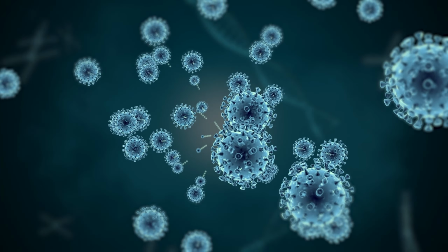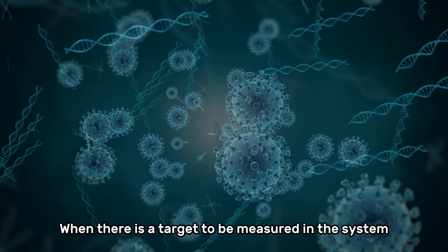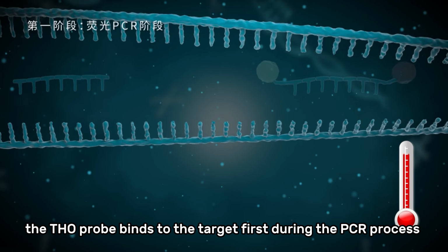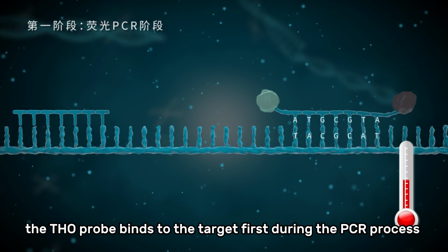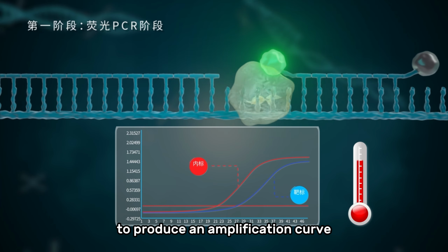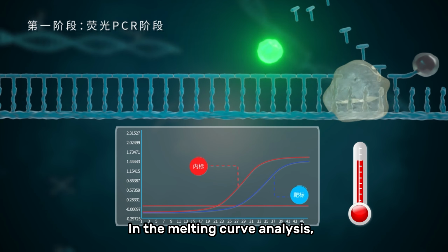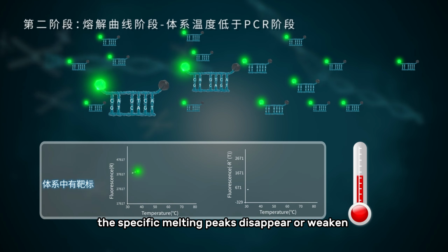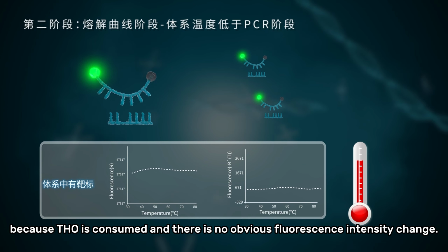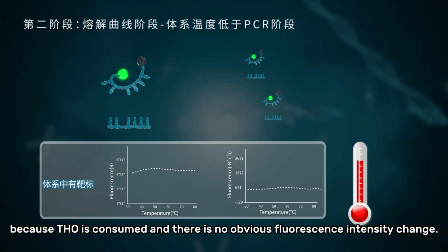When there is a target to be measured in the system, the THO probe binds to the target first during the PCR process, and fluoresces by enzyme cleavage to produce an amplification curve. In the melting curve analysis, the specific melting peak disappears or weakens because THO is consumed and there is no obvious fluorescent intensity change.